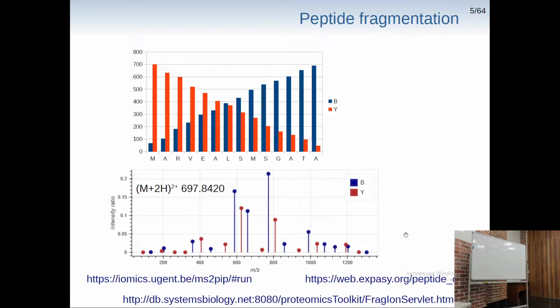For instance, if you have some protein, and you have no means to do Edman degradation, which would be fine, because at least 20 amino acids would be sequenced at really high quality. And you have only your mass spectrometer, and your protein, let it be a lot of your protein, a gram of your protein, so you can do everything you want with it. And you want to get as good a representation of the primary sequence as you can. What will you do? Here we have only a tryptic peptide. Can you use a different protease, for instance? We've already talked about protease profiling, right?